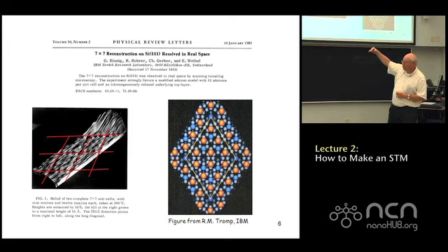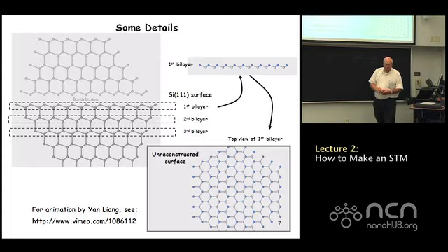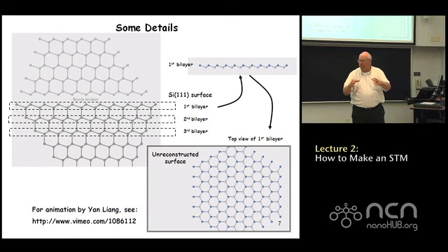It's not triangular, it's two triangles stacked one on top of the other. It tries to give you a visualization of where the atoms are with respect to that parallelogram repeat cell.